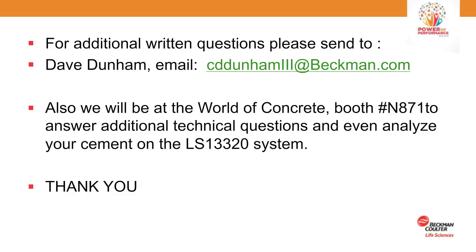Well, I'm sorry, I see some more questions coming in, and since we have some more time, let's go through them. So another person asked, how does the auto rinse work? The auto rinse is computer controlled. The module has a high level, top level optical level sensor. So we drain and fill the module 3 times, or this is actually selectable by the operator.